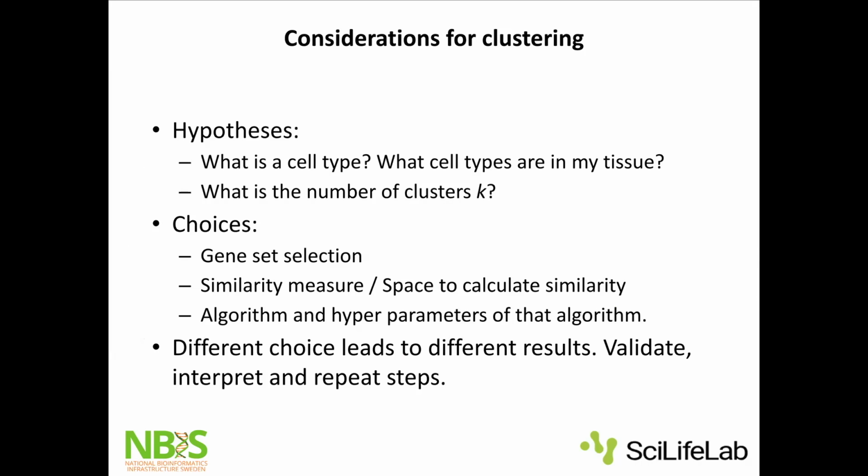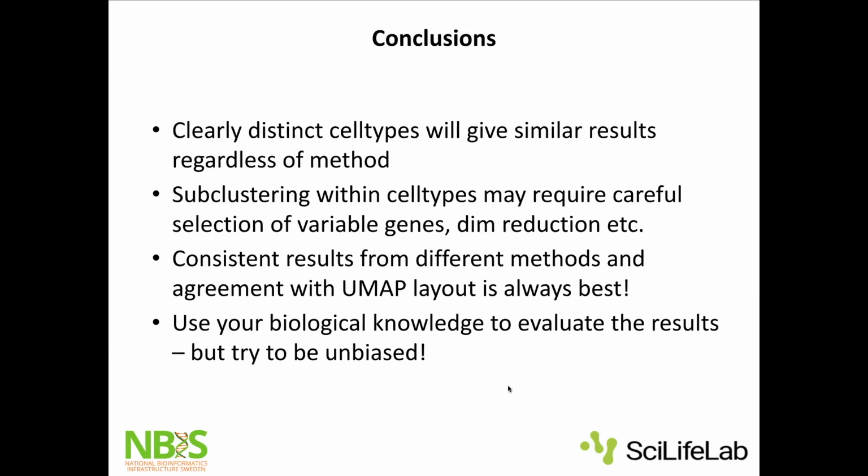There's a danger in deciding beforehand that we want 4 clusters and then tweaking the parameters to get 4 clusters, and maybe missing out on important novel information that you didn't expect. And then try a few different methods, see if it looks the same.